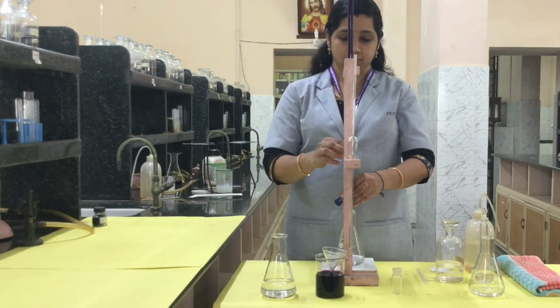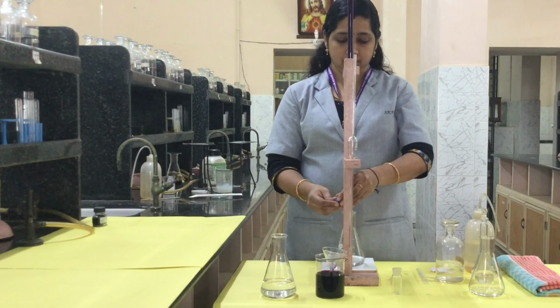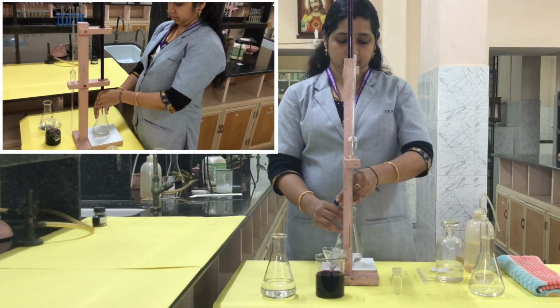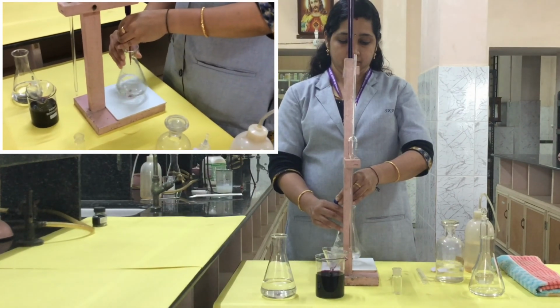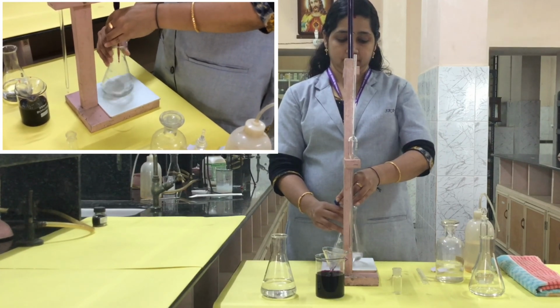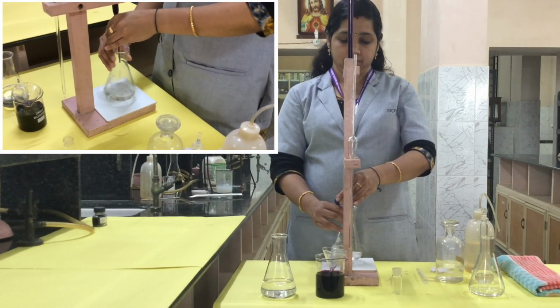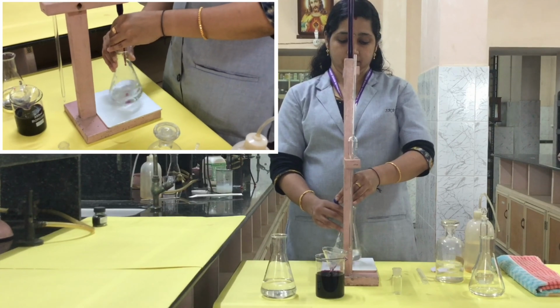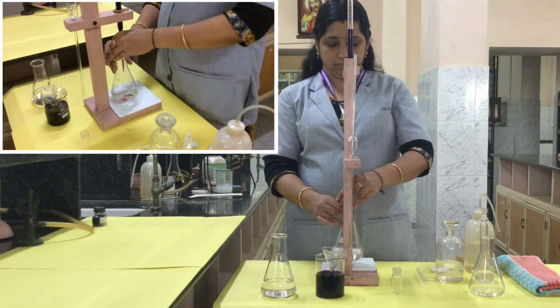First slowly add 1 or 2, 3 drops. Add 1 or 2, 3 drops first, shake it well, and slowly release the burette, then add this KMnO4 into the solution till the end point is reached. Just observe the conical flask, whether any change has taken place or not. 1 or 2, 3 drops are coming, and just swirl this conical flask. And you can see the color is disappearing, you can't see any permanent color, the color is still disappearing.